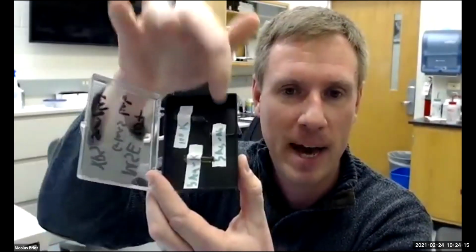Or the second mount. So something that I want to talk about is, I showed earlier that image of the interaction volume and where the signal is coming from. At 8 kilovolts, like I'm using right now, the depth of what's being probed, we're talking about less than a micron. So that's where you also have to think about those things. If you have the rod just like this, and I put the beam at the surface, the X-rays generated come from the first micron. Keep that in mind, like 1 micron in depth. So if the silver, or what you try to diffuse in it, is in the first micron, we'll see it.